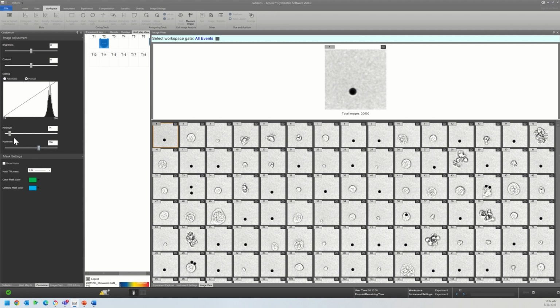And then if I need to, I can make some little changes here that will then be reflected in the image window. And if you want to go back, you should be able to reset everything to 0.